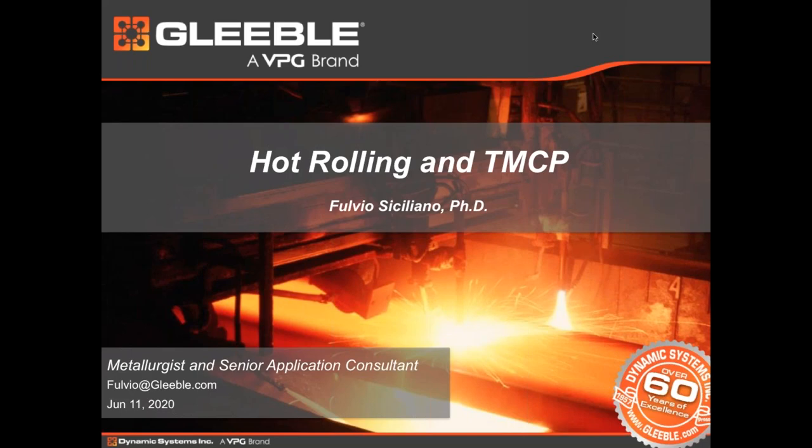Our team really misses the days when we could all go out and meet with researchers and learn about challenges that you are facing and help you provide solutions. But since we can't travel, we appreciate you joining us for these webinars as they give us a chance to stay connected. Today's discussion will focus on hot rolling and TMCP studies with an obvious focus on Gleeble capabilities.